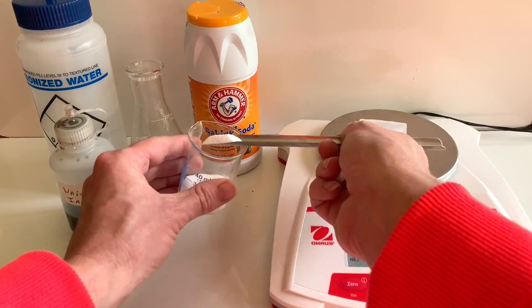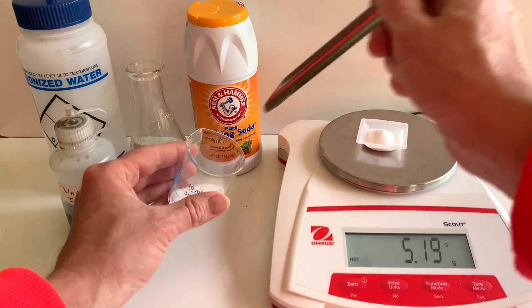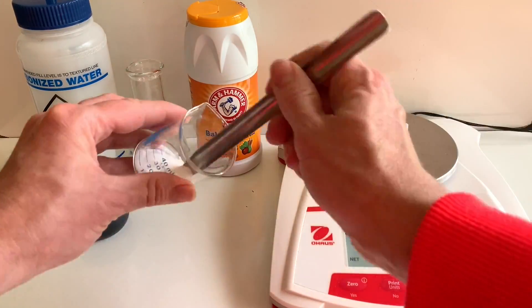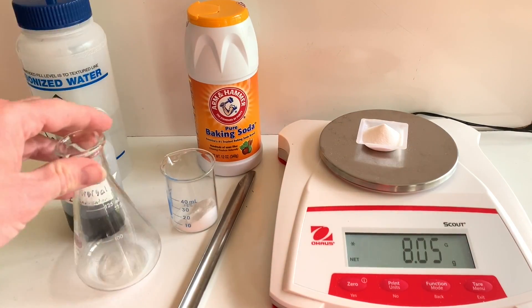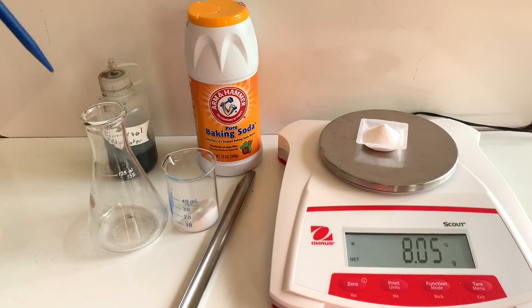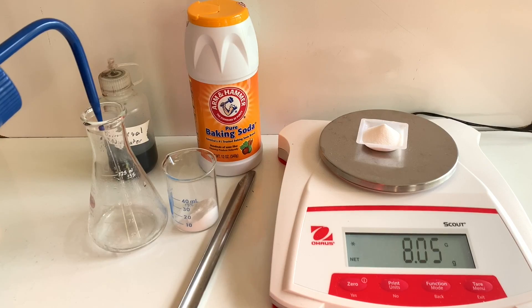So here's the experiment. 8.05 grams was measured out of the sodium bicarbonate, which is baking soda. Then water was placed in the Erlenmeyer flask, distilled water, to dissolve the sodium bicarbonate.